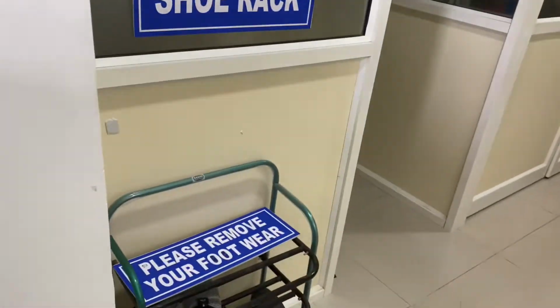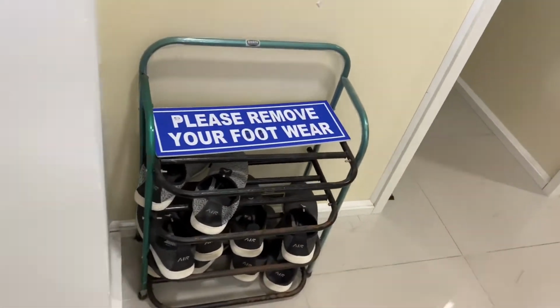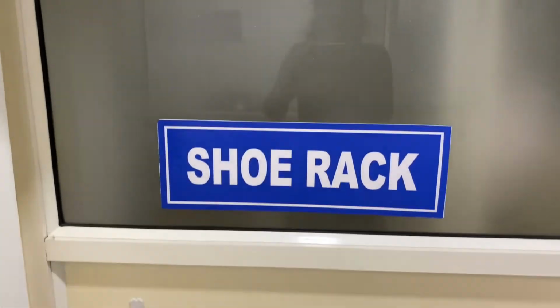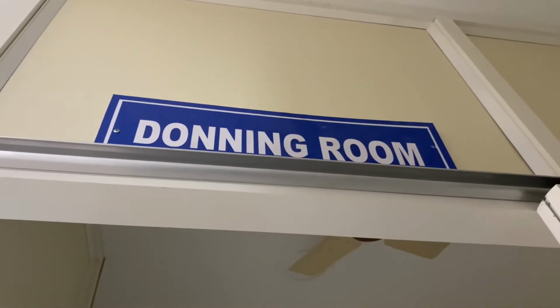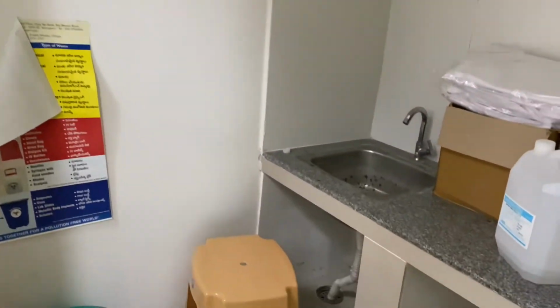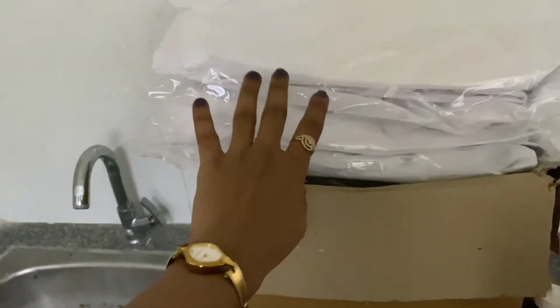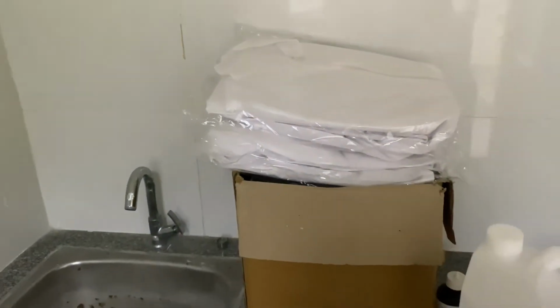Okay, this is the entrance. Inside, the first one is the shoe rack. Then here is the donning room. Donning room means we have to wear PPE, personal protective equipment, here. So these are the PPEs. Before performing the test, the technician has to wear this.